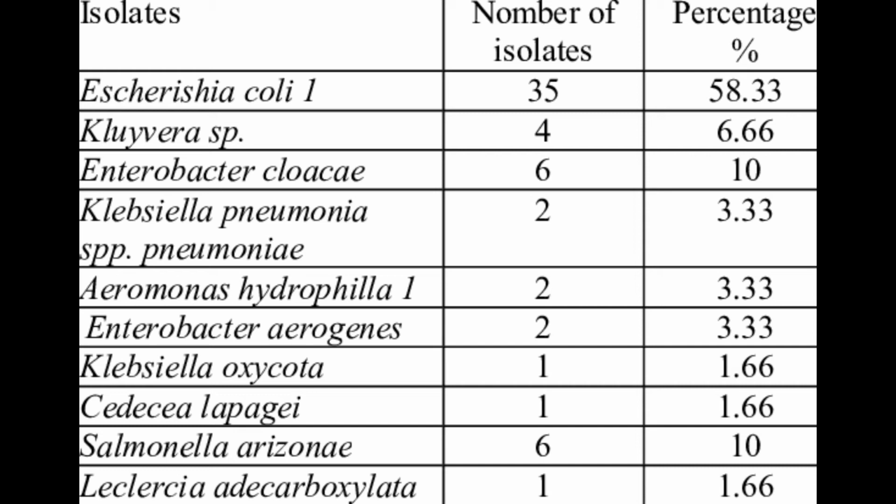Another medium on the market is phenylalanine agar, wherein ferric chloride is already incorporated and yields a different color reaction. The positive is a brown slant. Now, phenylalanine deaminase is an enzyme that removes the amino group from an amino acid. The medium is phenylalanine agar with 10% ferric chloride, which results in green.